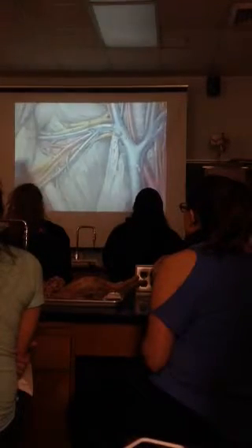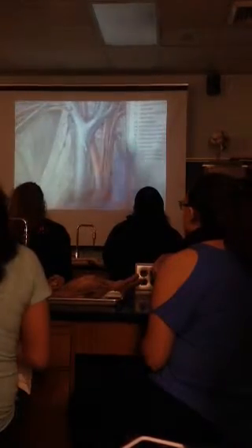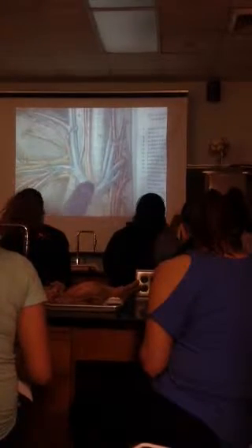You have to think of yourself as the cat laying down. So this is all the right side of the cat. So you literally turn your body and make sure, it's my left side, but it's the right side of the cat. And then left will be over here. So this will be brachiocephalic artery, right brachiocephalic. Which will then branch up into right common carotid.